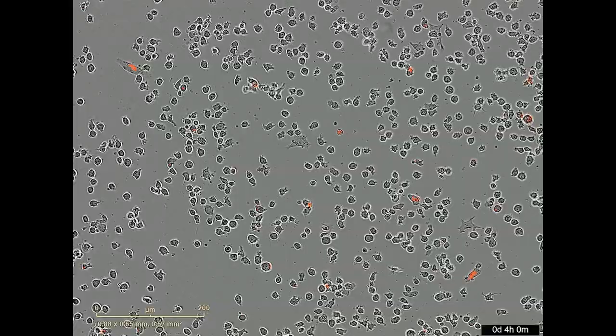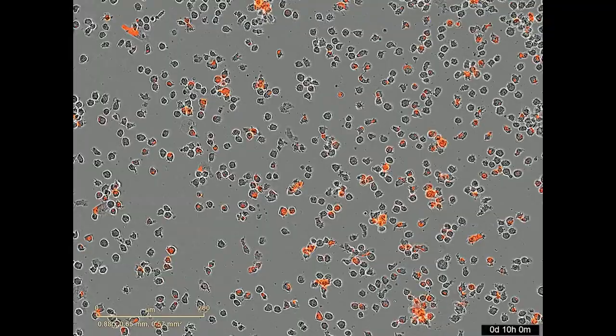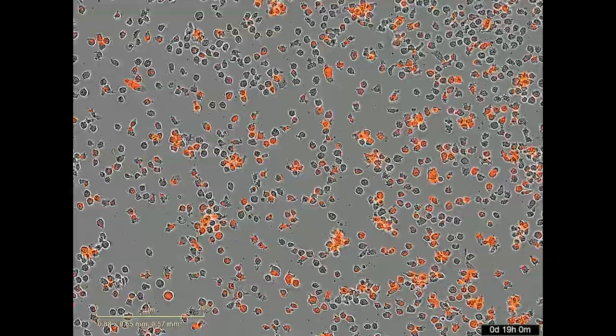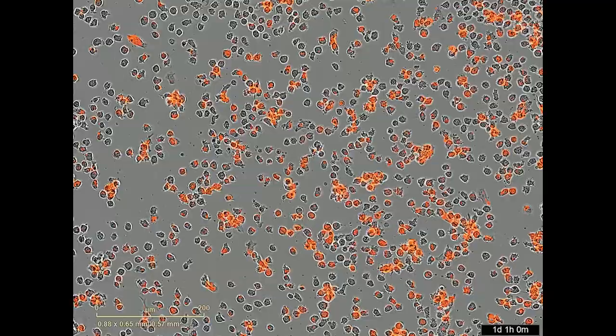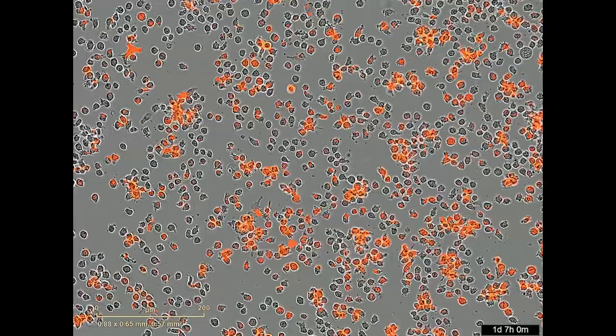The cells were imaged each hour to monitor the phagocytic response. We can clearly see that with time more and more cells start to pick up the protein as the red fluorescent signal keeps increasing.